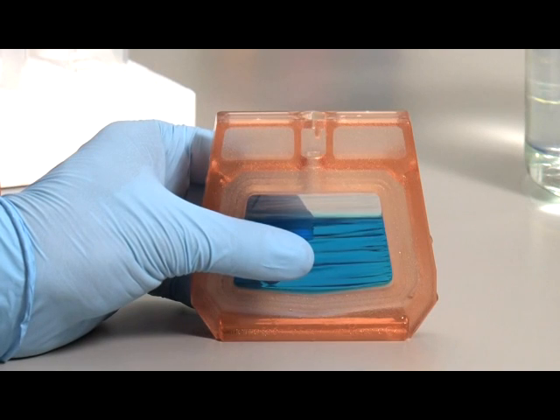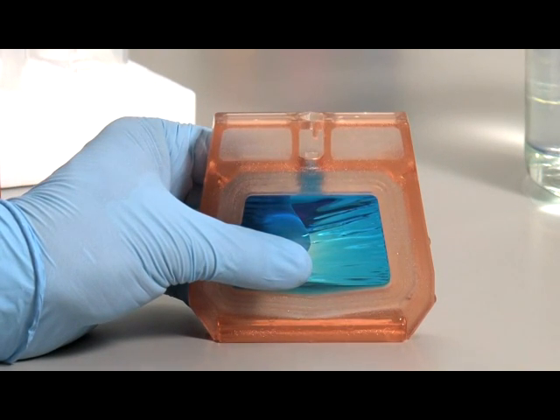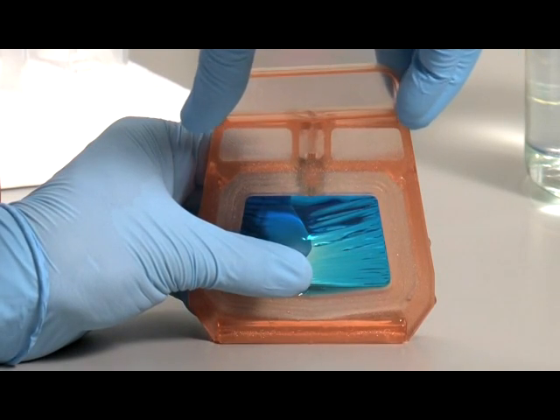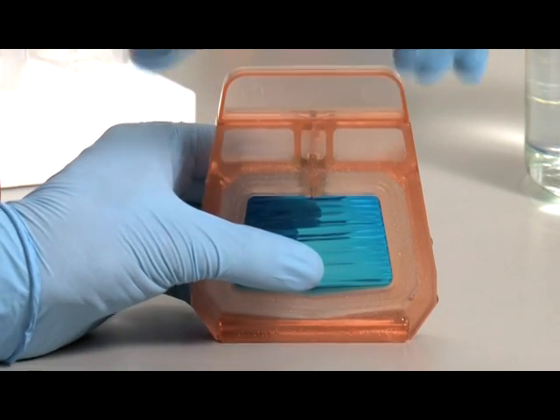Using gloved hands, slowly squeeze the membrane to remove excess air from the chamber. Reinsert the cap and twist to lock. Your sample is now ready for dialysis.